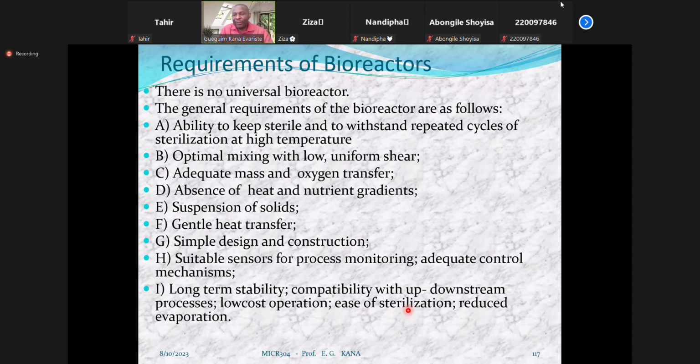Now, that comes into play when you are dealing with a small size reactor, let's say 1 liter, 2 liter, 3 liter, you can easily autoclave the entire reactor. That's sterilization. Remember the heat sterilization that we carried out in micro360. When you have a small size reactor, 1, 2, maybe 10, you can put everything inside the autoclave and heat it up. That's the heat sterilization. Now, when the size is larger, obviously you will not be able to put it inside the autoclave, but you carry out in situ sterilization. A little bit of what you saw in your prac.